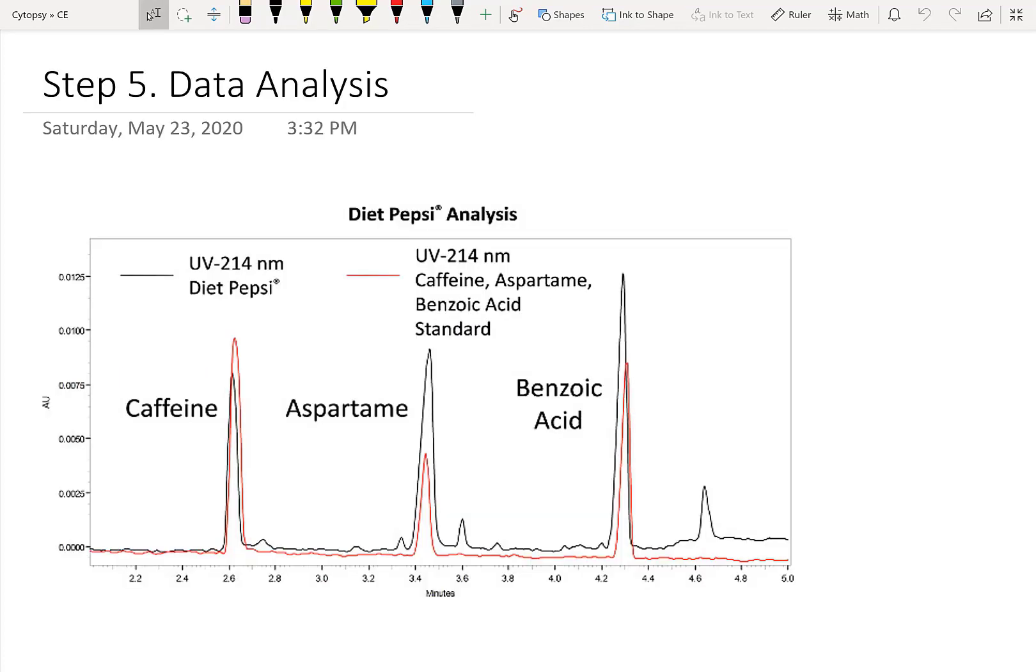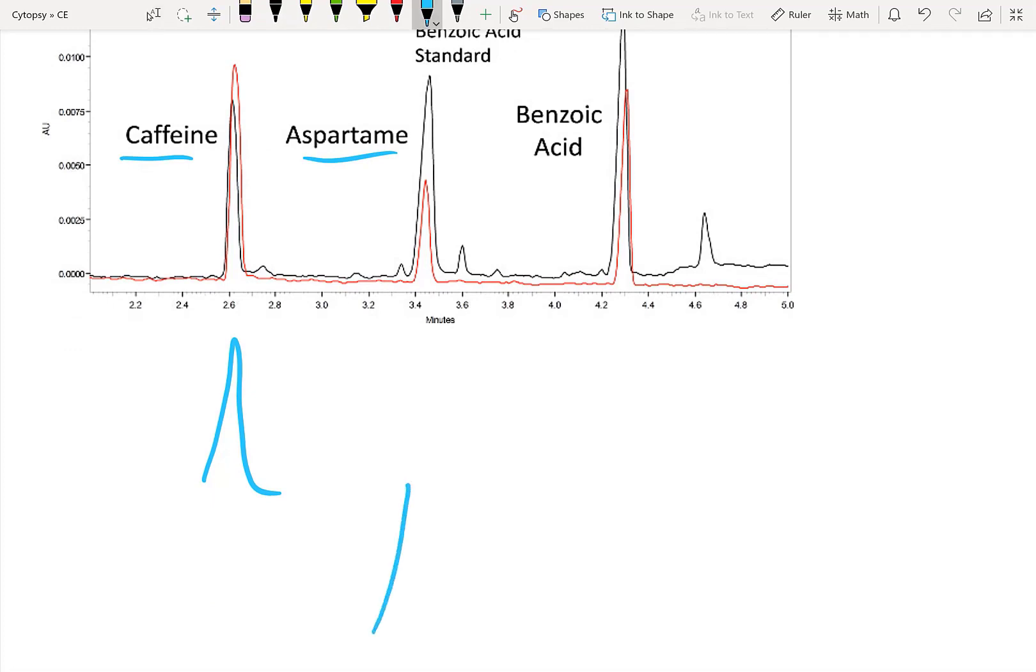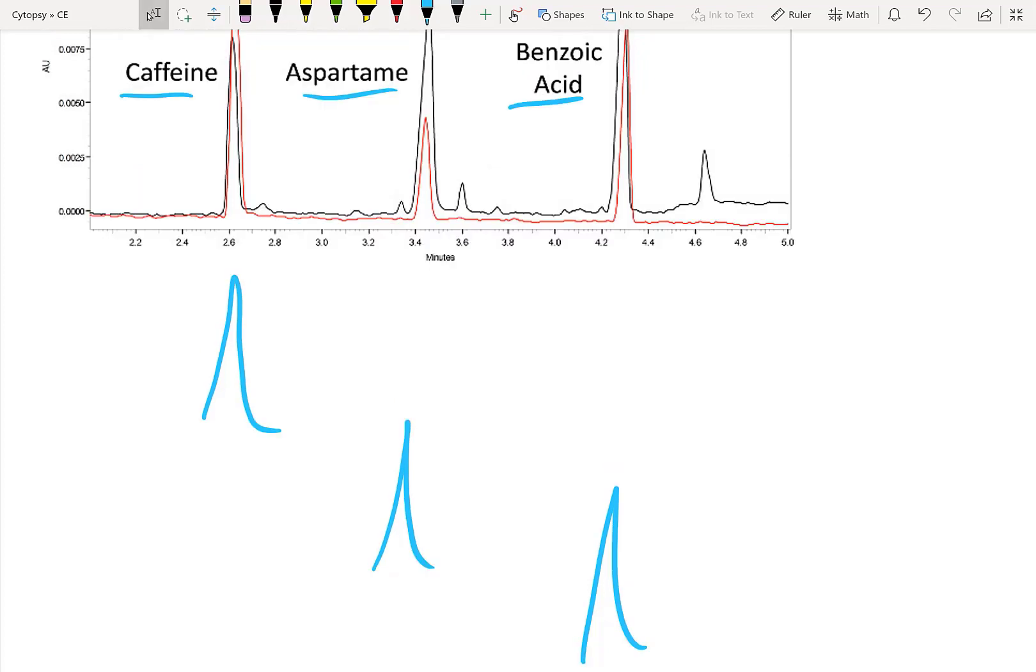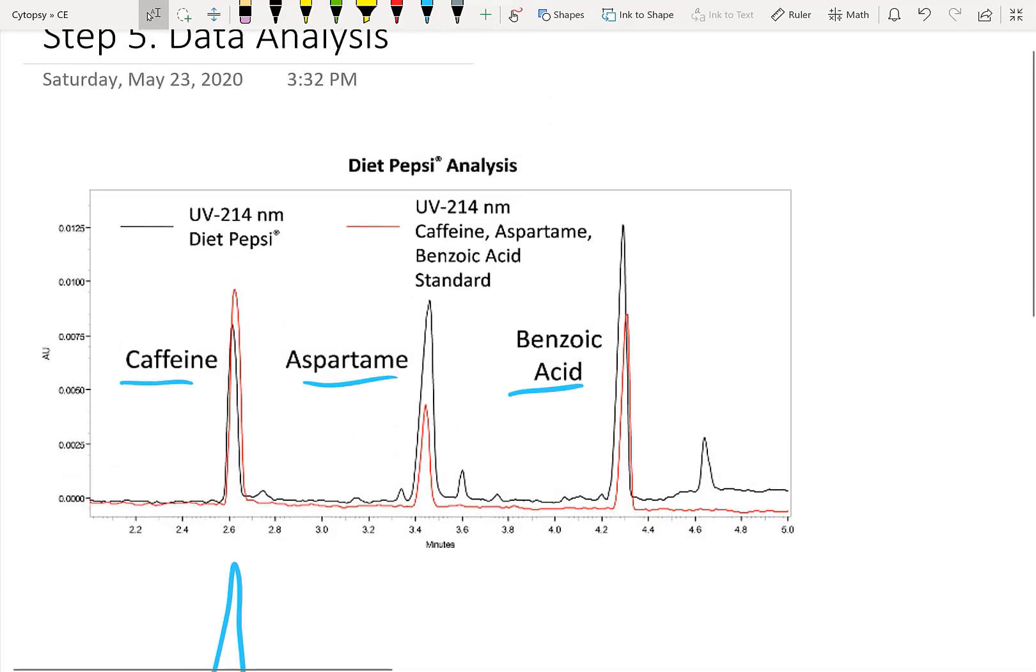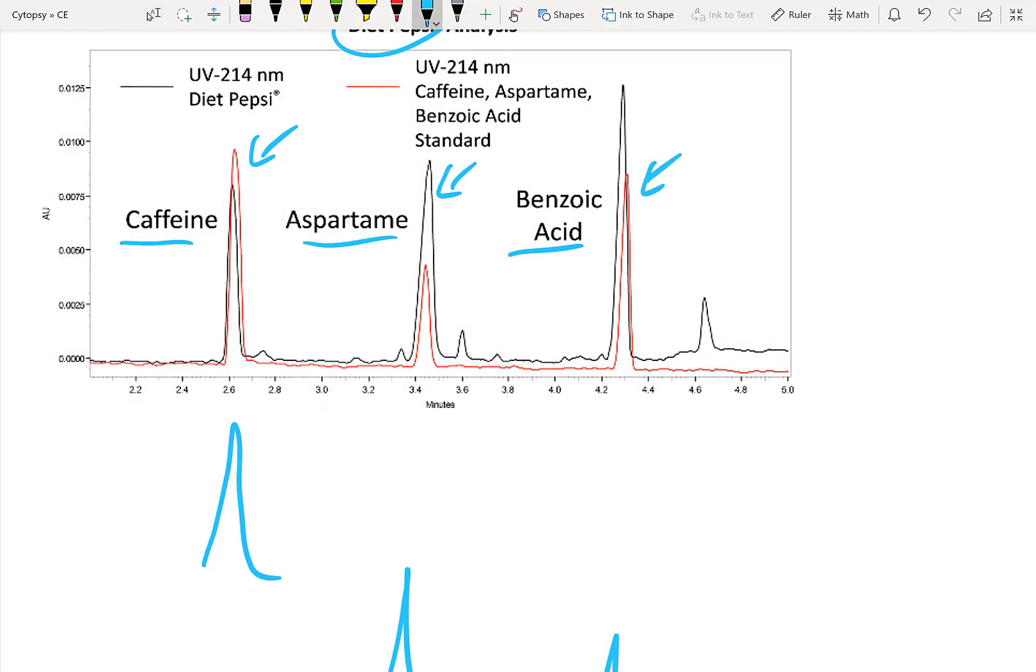And here's the final data from the JOVE protocol. As you can see here, we actually ran multiple samples. First we ran just caffeine and caffeine gave a peak here at 2.6 minutes. Then we ran aspartame and aspartame just by itself gave a peak here at 3.4 minutes. And finally we ran benzoic acid which gave a peak here at roughly 4.3 minutes. Then we ran diet Pepsi and we saw three different peaks all together, and each of the peaks corresponded to one of the individual components that we ran. So this is a really good way of showing what are the components of diet Pepsi.